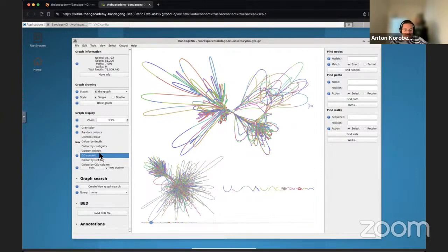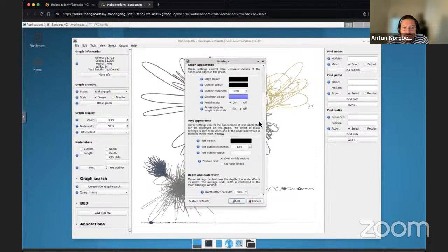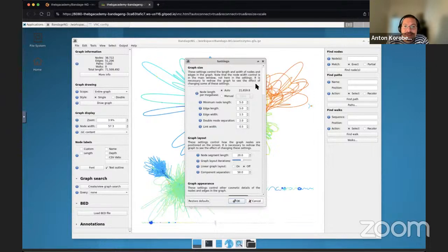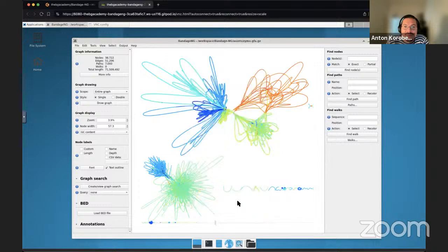Fortunately, we can double check this using the GC content. So yeah, you can see that they even have, let me switch the color scheme. Usually Jet or Turbo, pretty high contrast ones. Certainly if you have some perception difficulties, they might not be great, but let's try Turbo.